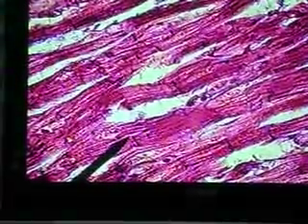Now, I am a bit skeptical, and you'll have to be a bit skeptical of some of the slides that are labeled cardiac muscle. In your box, there's only one slide that I would put a question mark on, and you show it to any of us. Call us in the lab when you're ready to do it. I have a strong feeling that about 3 years ago, some of them got away, just like germs. These are really smooth muscle slides, but they were labeled cardiac muscle. Sadly, in a couple of the boxes, there are some remnants of them.